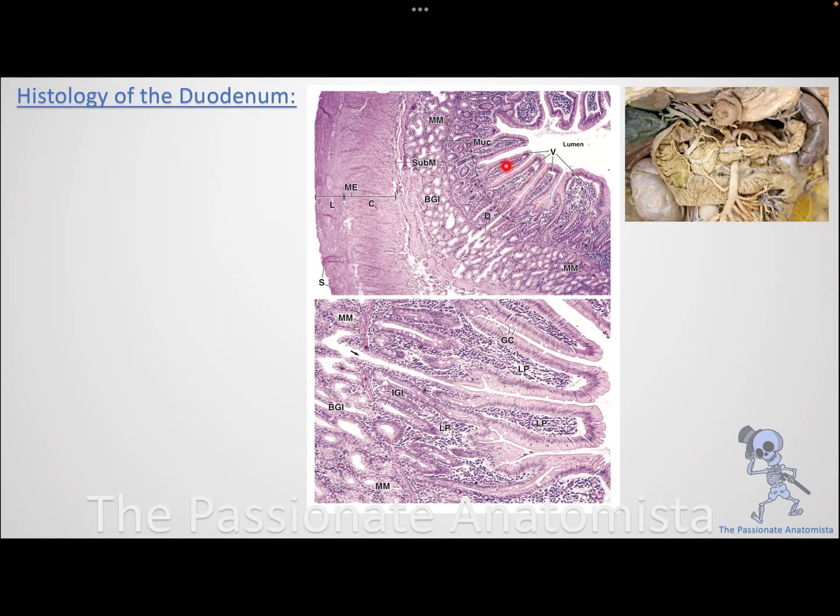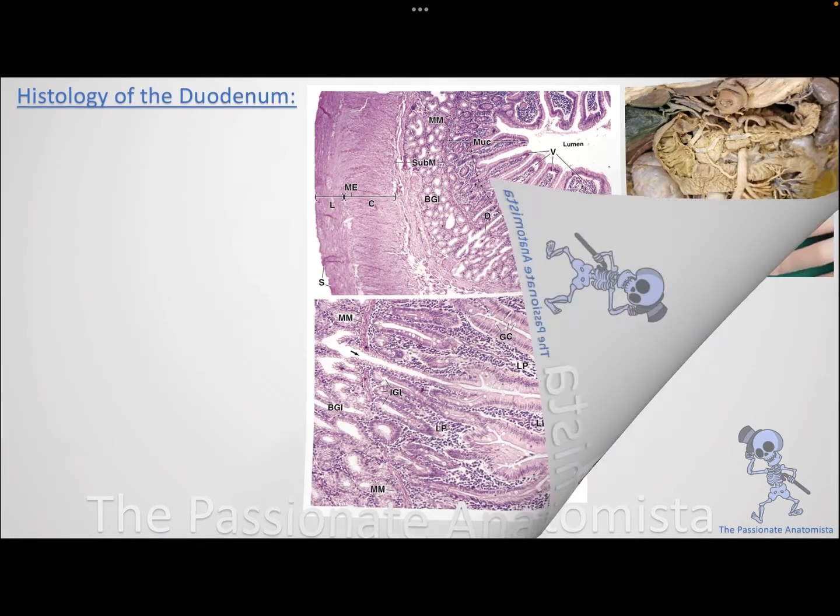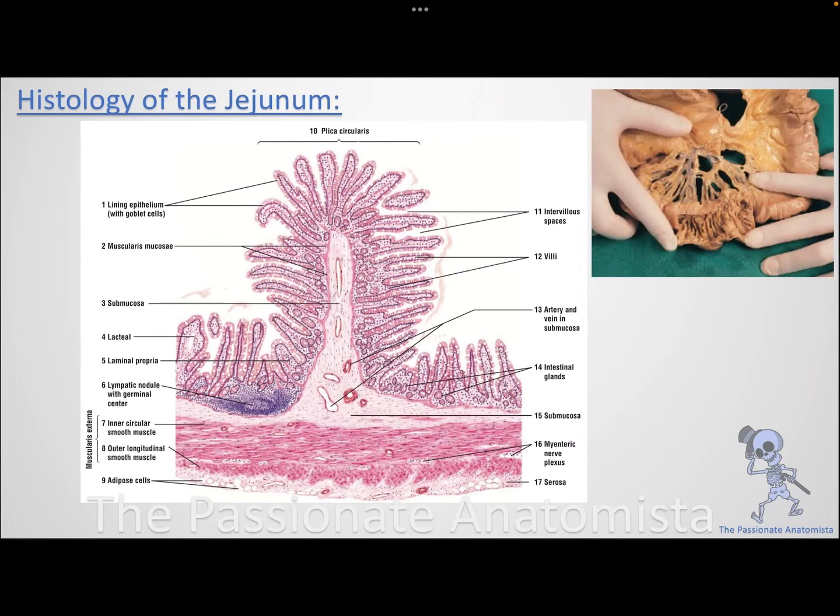You get to see the villi, the mucosal folds, and of course this circle here, this is a submucosal fold here. If I tell you about this folding, this is a plica circularis, or the valves of Kerckring. But if I show villi, these are mucosal folds with a core of connective tissue lamina propria. And then I have glands in the submucosa. This is definitely duodenum. Okay, again, this is a higher magnification. Very nice picture. Okay, and moving on to the jejunum.